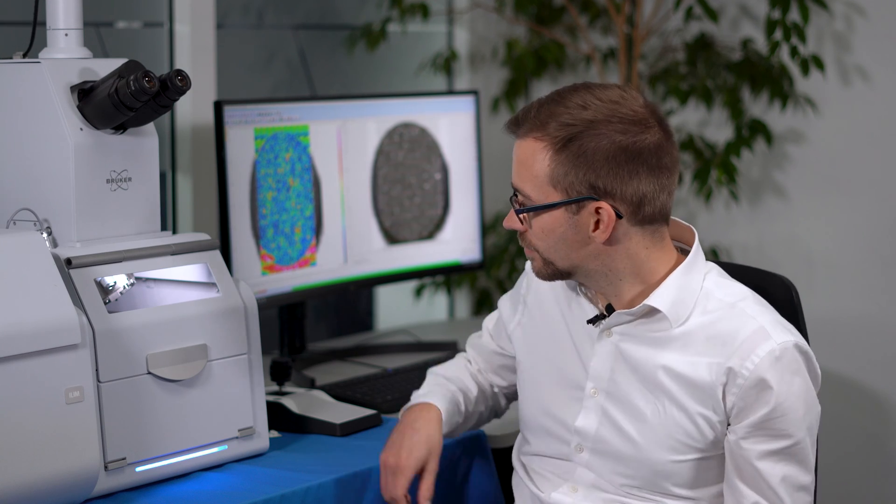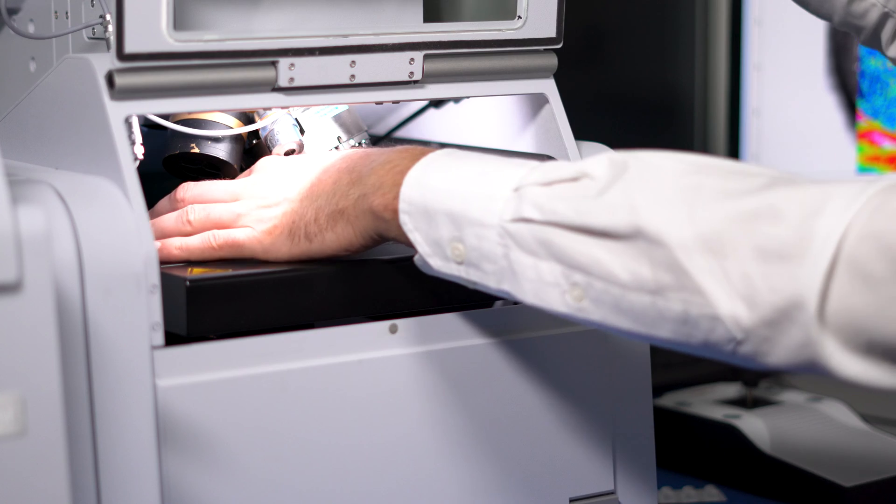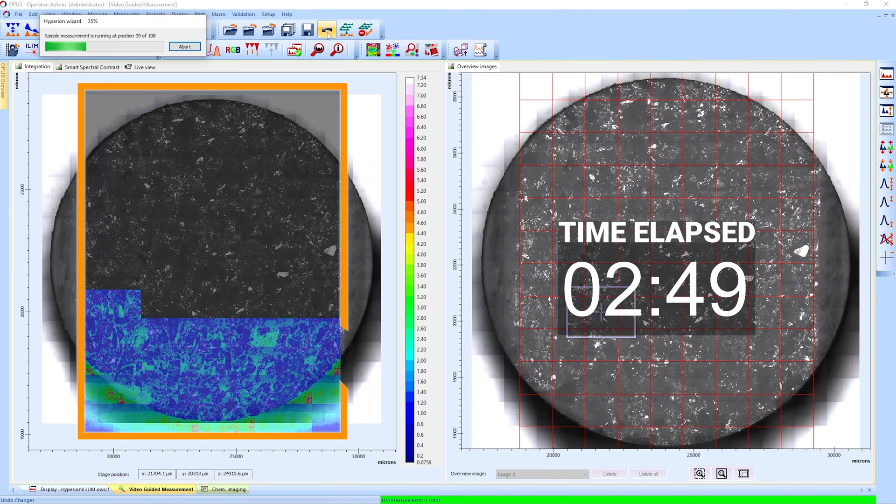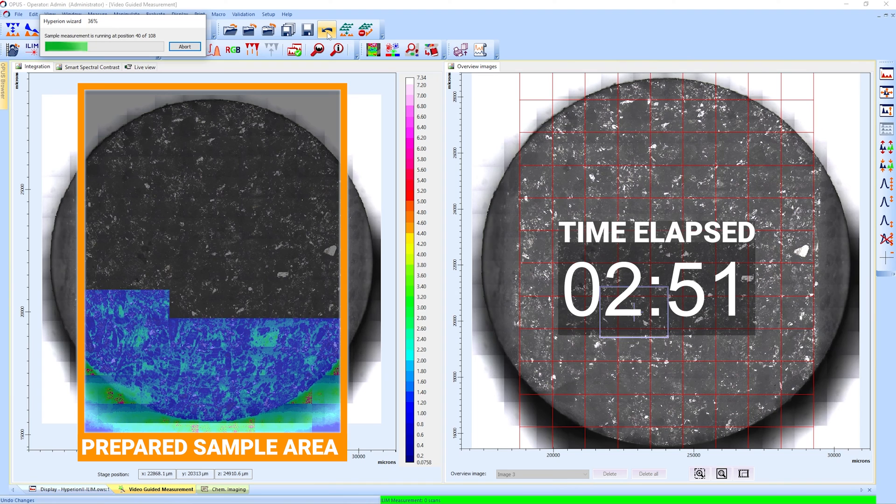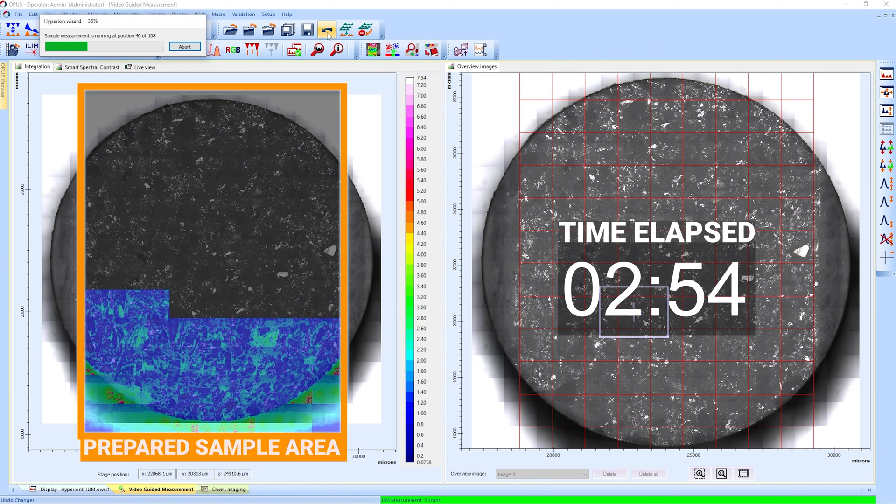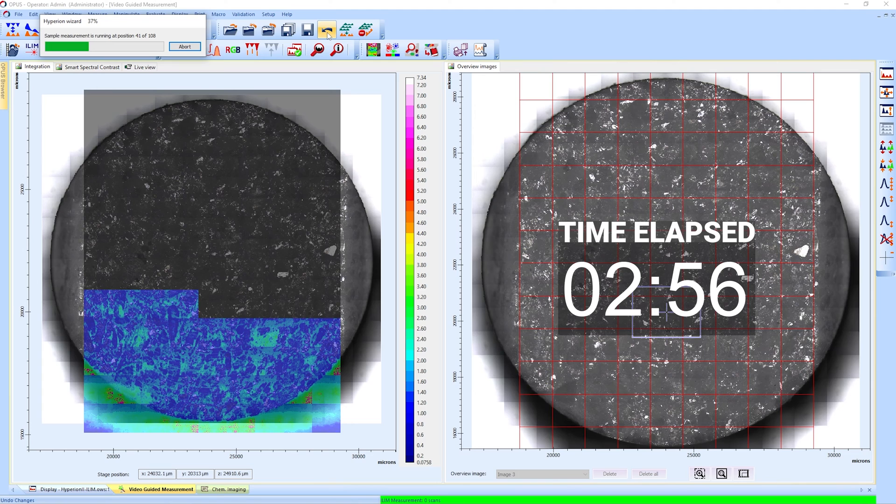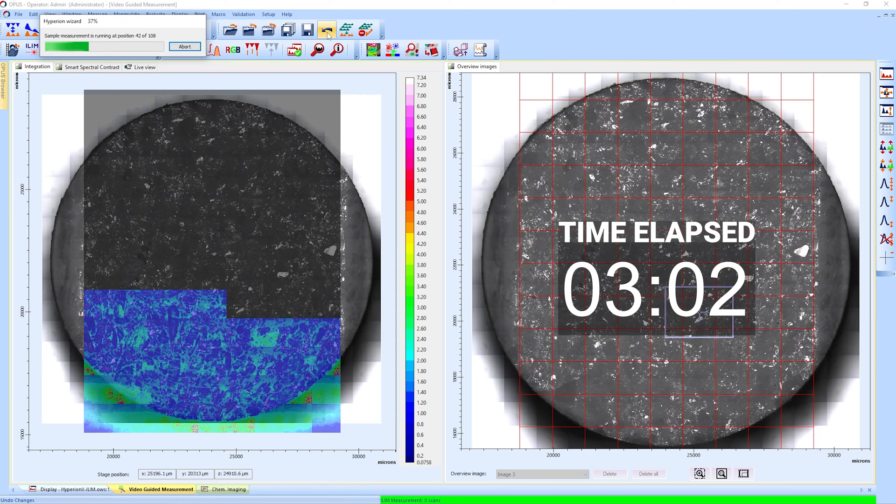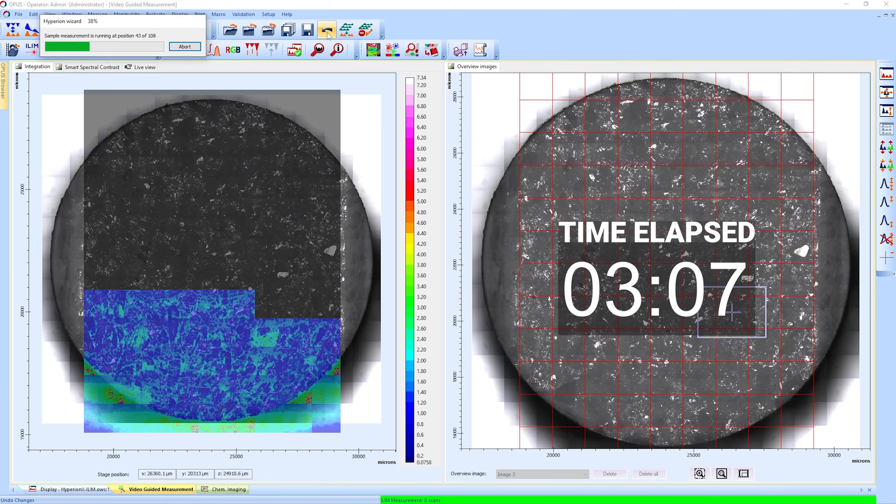Let me demonstrate. This is the live measurement of a tablet that was prepared with a tablet mill. With each tile, the Hyperion II ILUM covers 1.5 mm² and records 62,500 spectra with a pixel resolution of 5 microns in just 4 seconds.